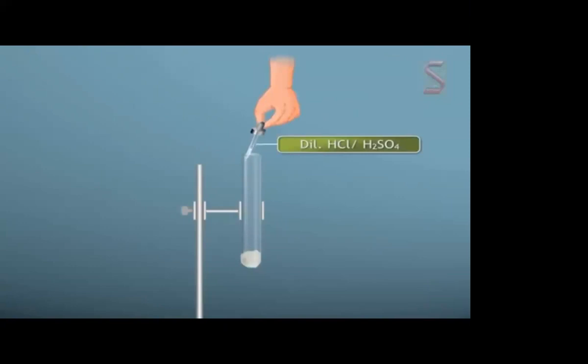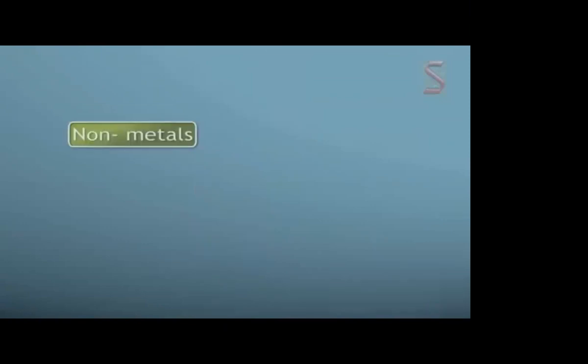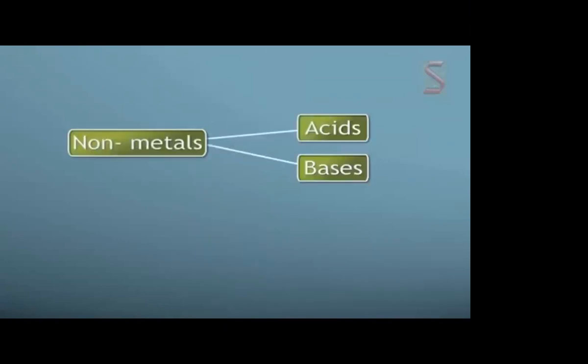Let's look at this small experiment. Take sulfur powder in a test tube. Add 2 to 3 ml of dilute hydrochloric acid or dilute sulfuric acid. There's no observable change. Unlike acids, bases do react with nonmetals.